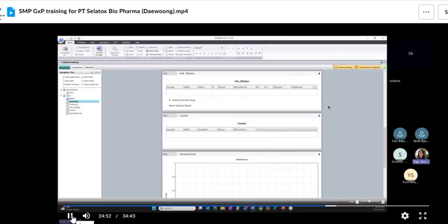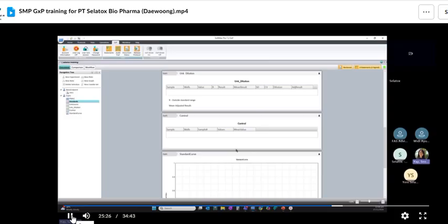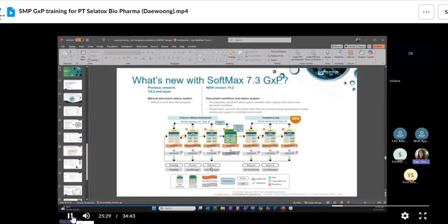So you sign off already, right? Then before you change it, I want to show you here. So you notice, right, this file as a lab manager, this release as an official protocol is not available now. But the moment I change this to review, I change this review pending to review, right? Later on, you will see this available. Okay, you see that? So you, as a lab manager role, you can make this as an official protocol file.